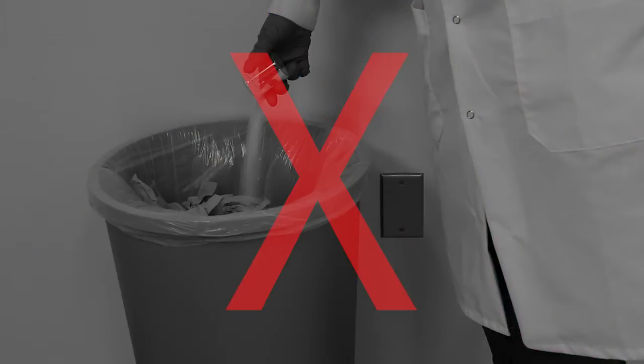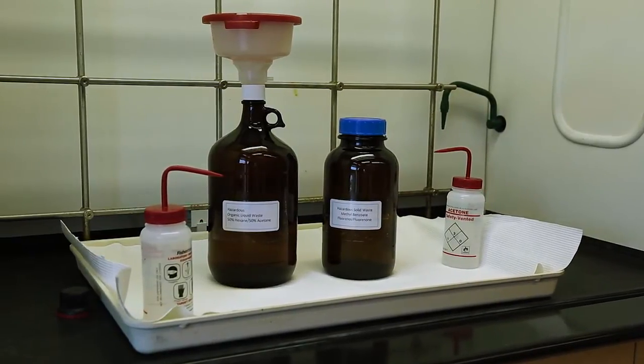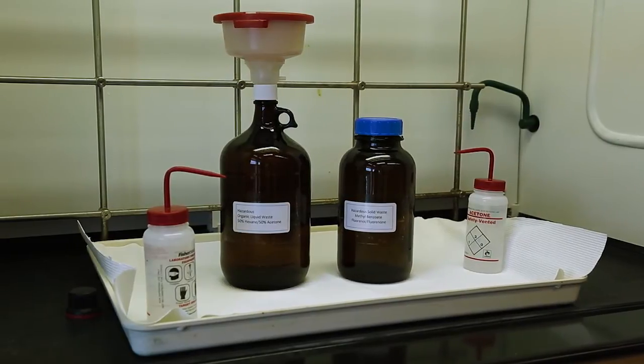Absolutely no waste should be thrown away in the trash. All liquids, including both reaction products and leftover chemical reagents, should be placed in the appropriately labeled bottle in the fume hood designated for waste collection.